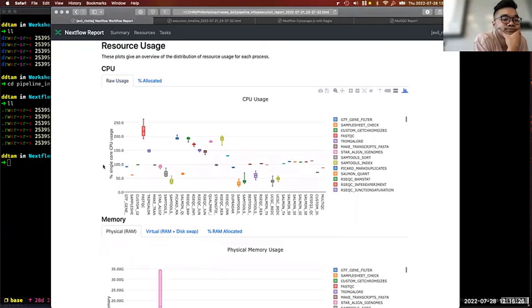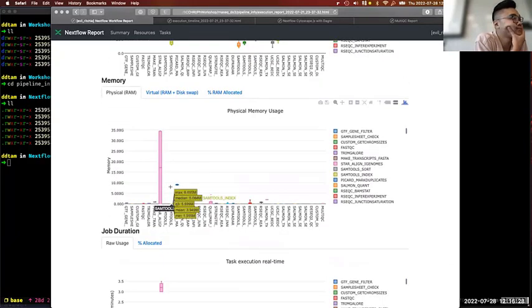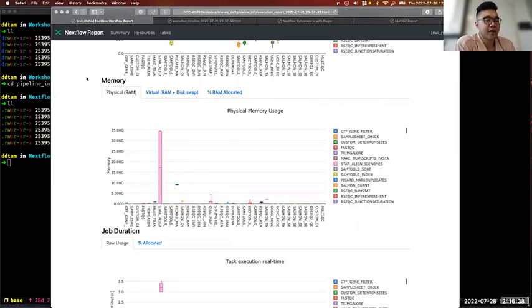So you can manually set up the Nextflow pipeline to offer STAR more memory. Exactly. Yeah, so that's the next example. Here you can see everything in terms of memory load is fairly low. I guess, what is this? Oh, Picard MarkDuplicates. It took 10 gigs of memory, but the biggest culprit here is STAR align.